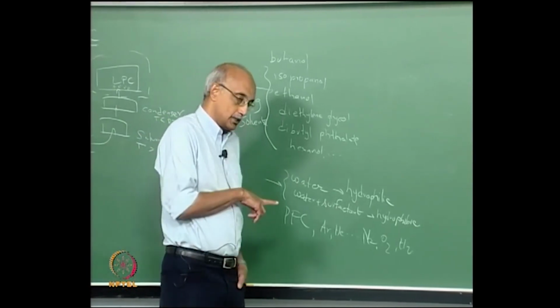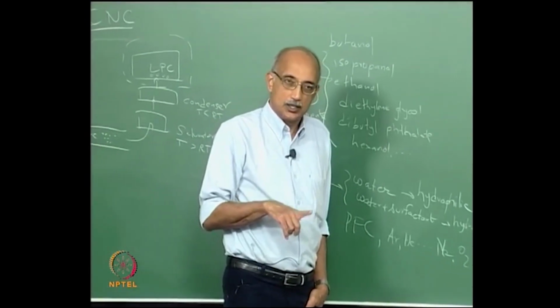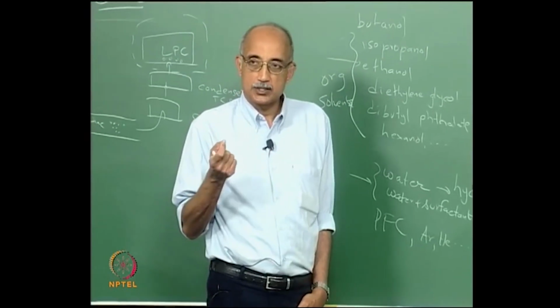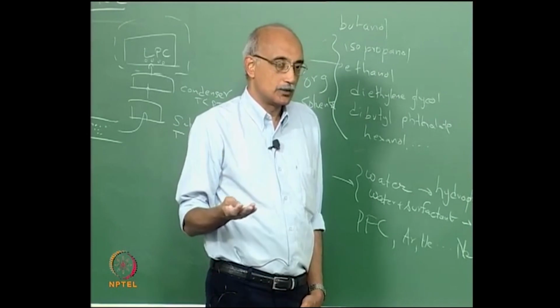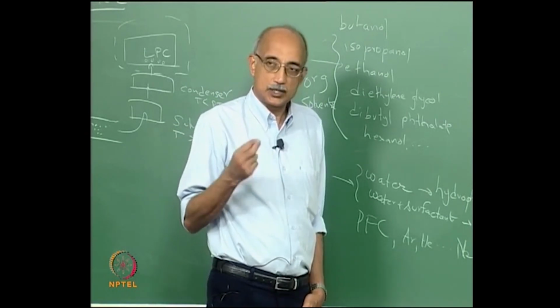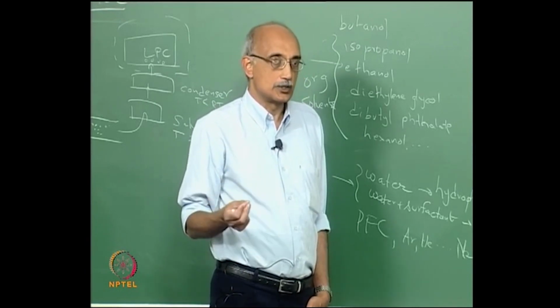Now this method that we have been discussing so far, the condensation nuclei counter method, really works for fine droplets or ultrafine materials in air and other gases. How about if they are in a liquid? Can you still use this technique? It's actually not possible to use a condensation nuclei counting technique for particles that are suspended in liquids.